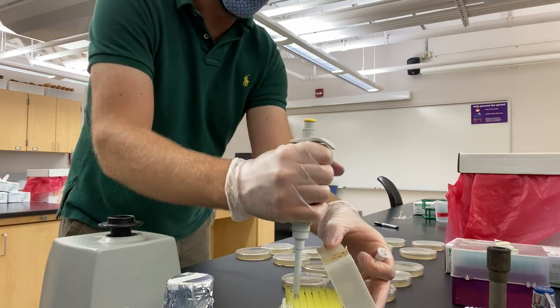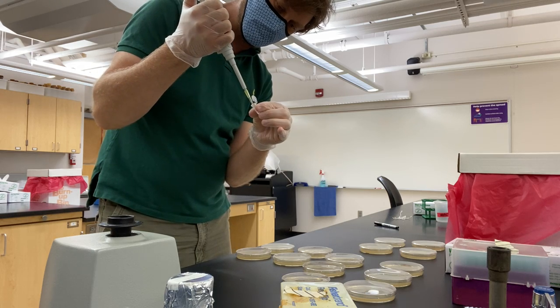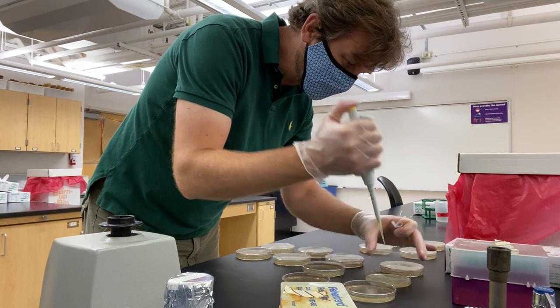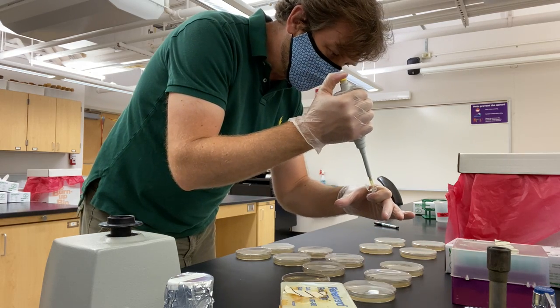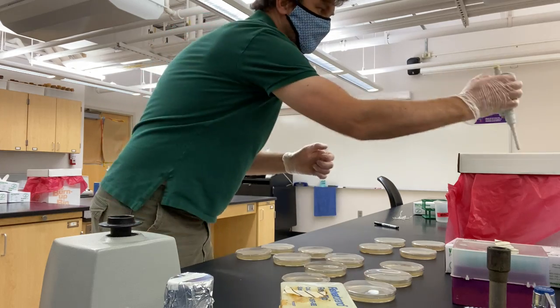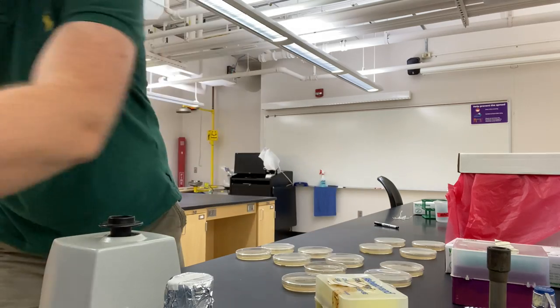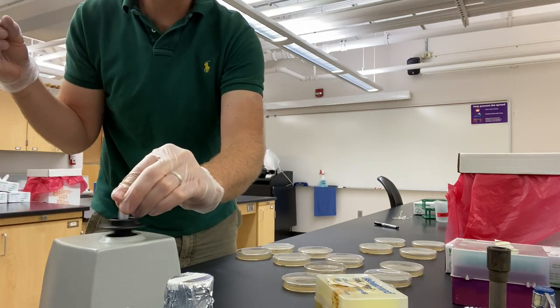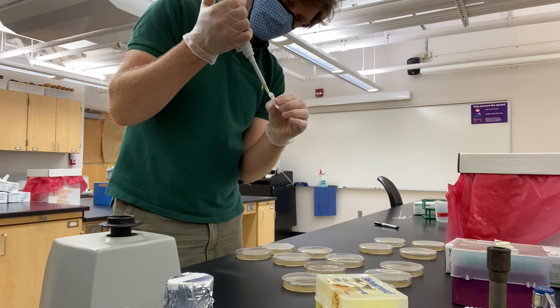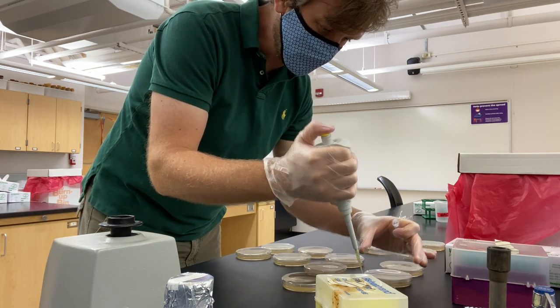Vortex. New tip. 10 to the minus 6 plates — into the sterile garbage. And one last one. New tip. 10 to the minus 8. Two petri dishes for that one.